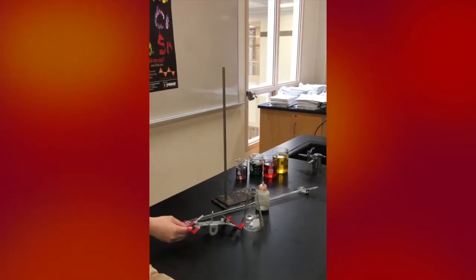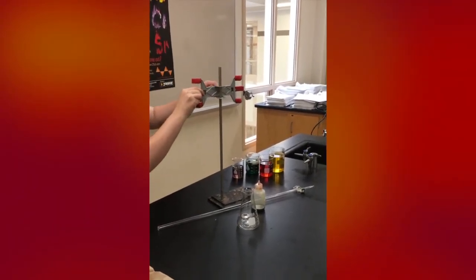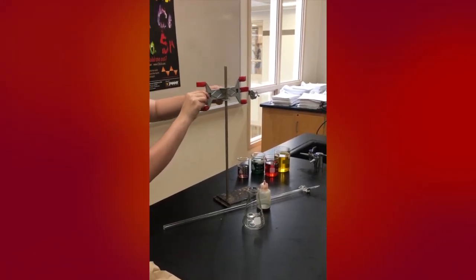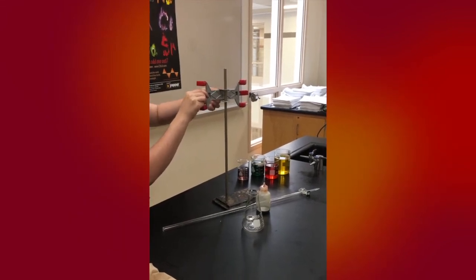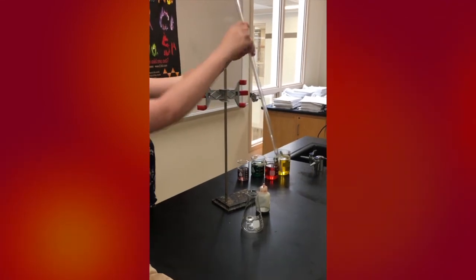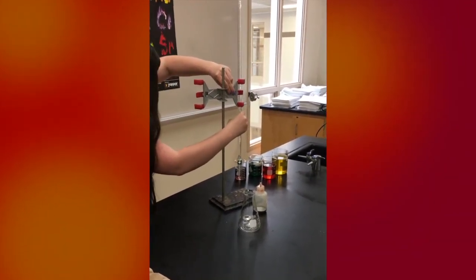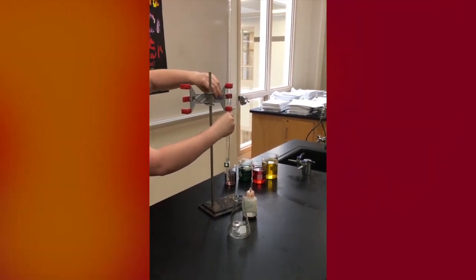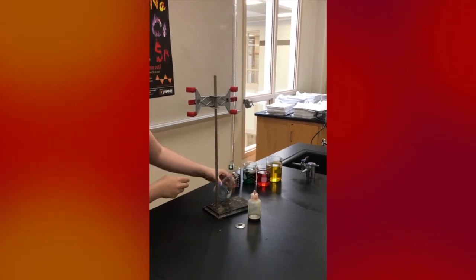First, you take the burette clamp and clamp it onto the stand. Then you take the burette and place it in the clamp. Then you take the Erlenmeyer flask and place it under the burette.